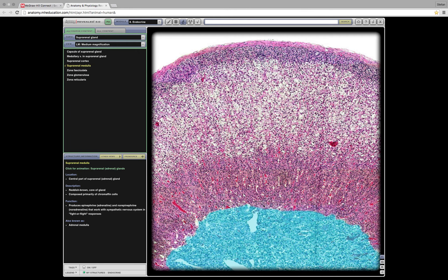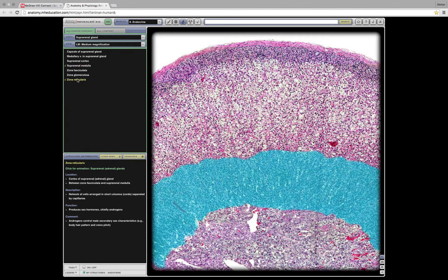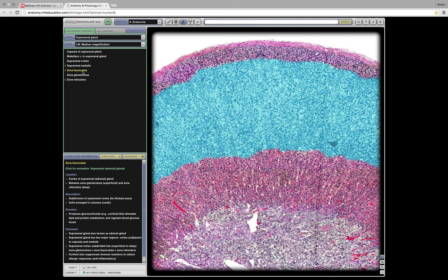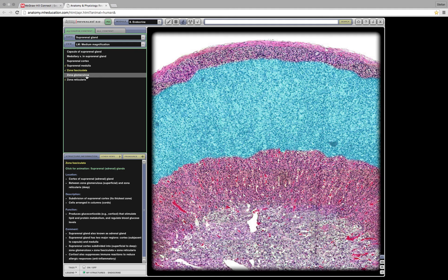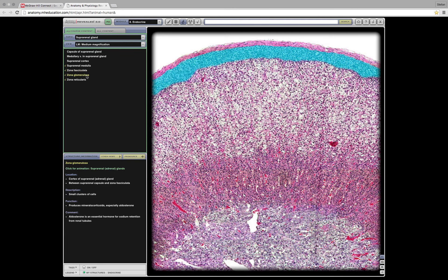The one above that, that's called the zona reticularis. The one above that should be the zona fasciculata. Yep. And then the one above that should be the zona glomerulosa. Glomerulosa, yeah.